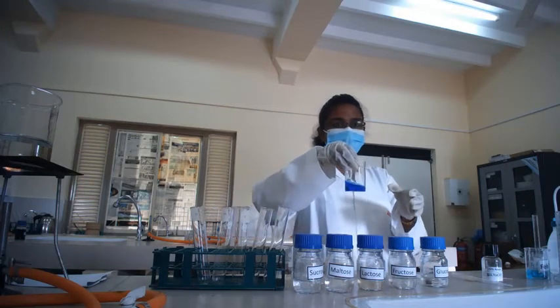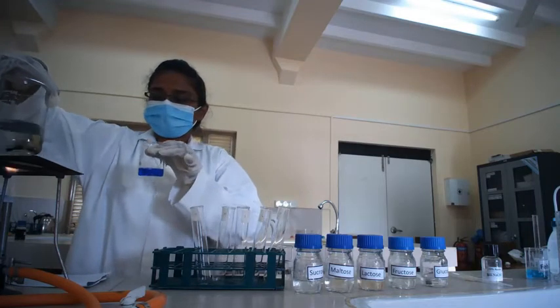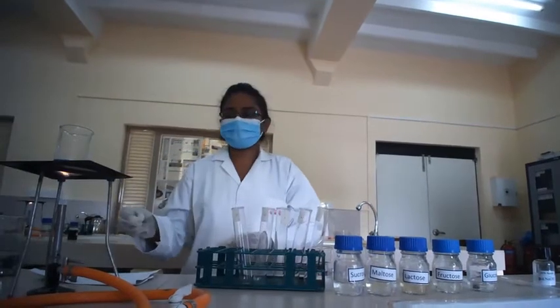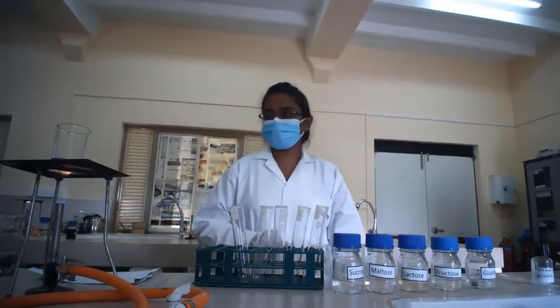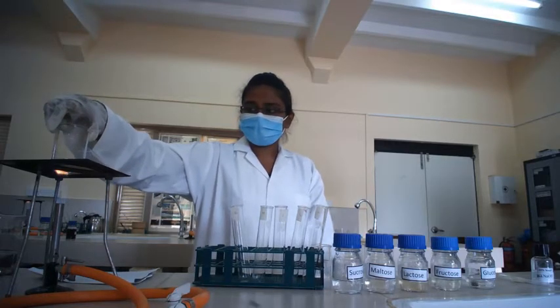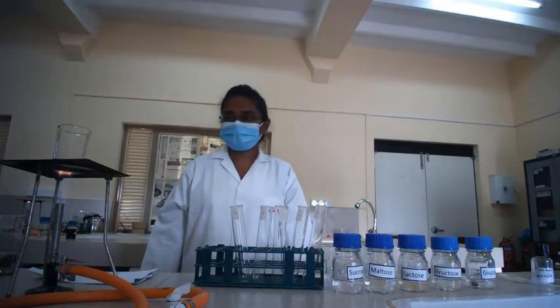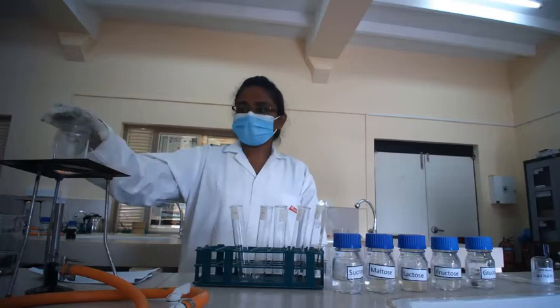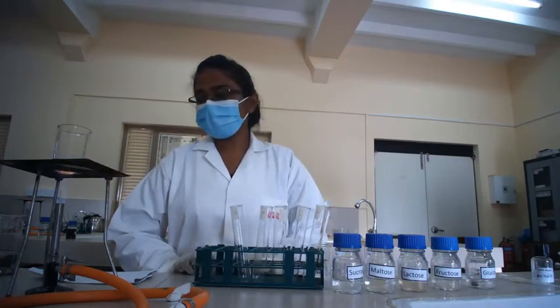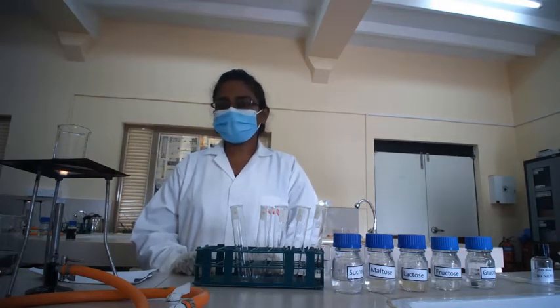Now we are going to boil it by using a Bunsen burner. We don't need to boil it for a long period of time. We boil it for 1 to 2 minutes to remove the dissolved oxygen in the solution.